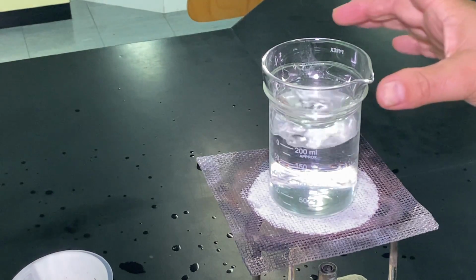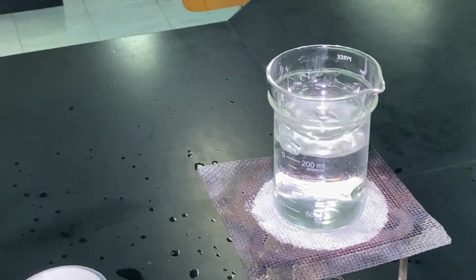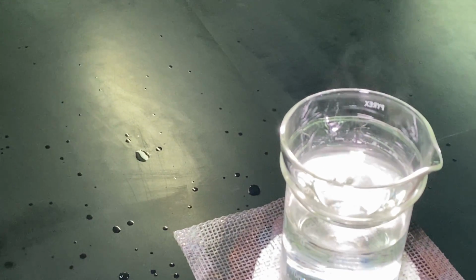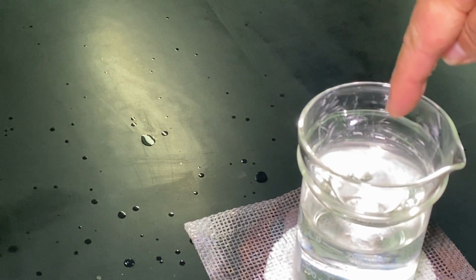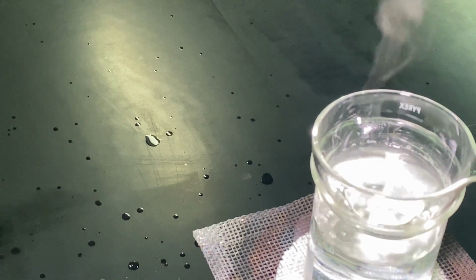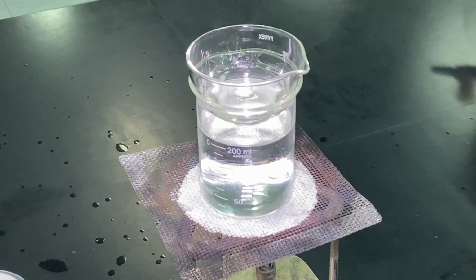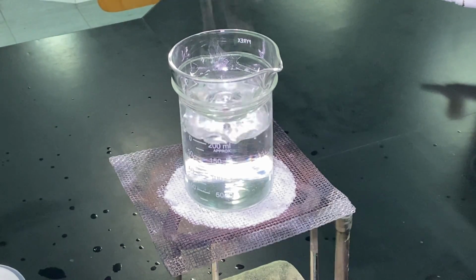Turn that off for now. Hopefully you can see that there is, just around the edge of the hot sodium chloride solution, some pure sodium chloride being left behind. Right, let's carry on the heating process.